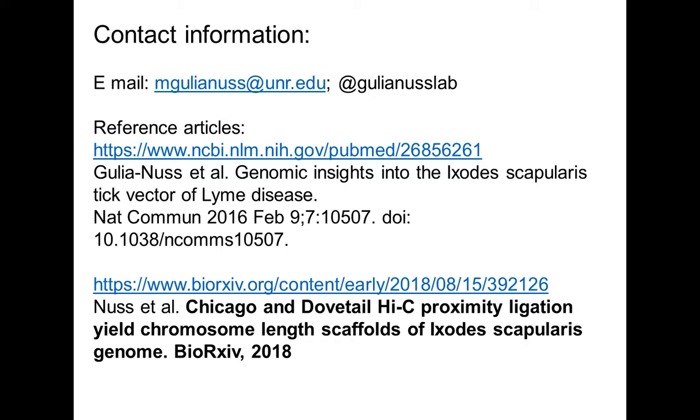Thank you. The next question is, if I could only do one, which is better, Chicago or Dovetail Hi-C? Okay, I can take that question. It really depends on starting contiguity.